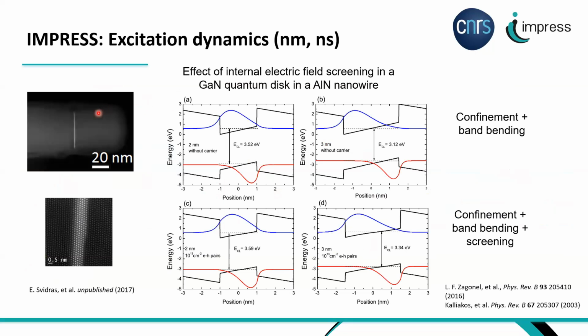This is the first application that we propose: to study individual quantum disks of gallium nitride within aluminum nitride nanowires. I can answer you afterwards, Carlos, in a little bit.